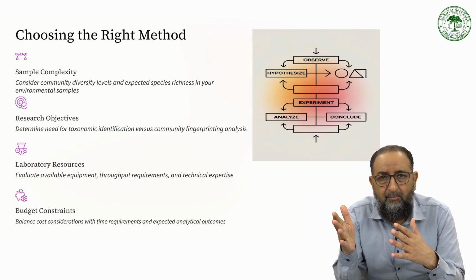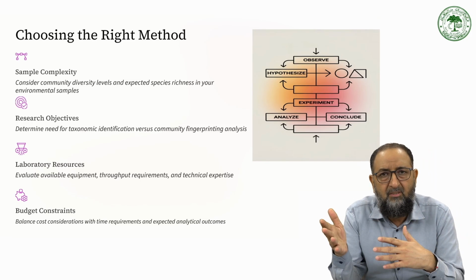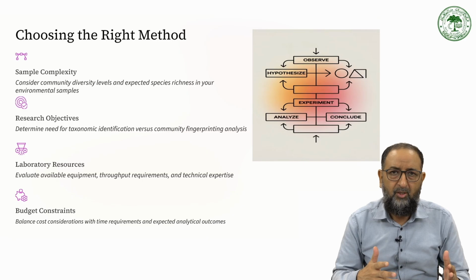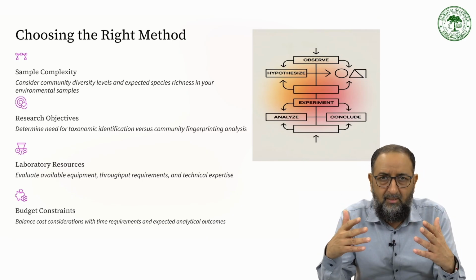Whether it is a clinical sample, an environmental sample, or some other diversified microbial sample, whether it is a gut microbiome, a vaginal microbiome, or an oral microbiome, every microbiome has a different complexity. Accordingly, you have to choose the method. I think this is all.